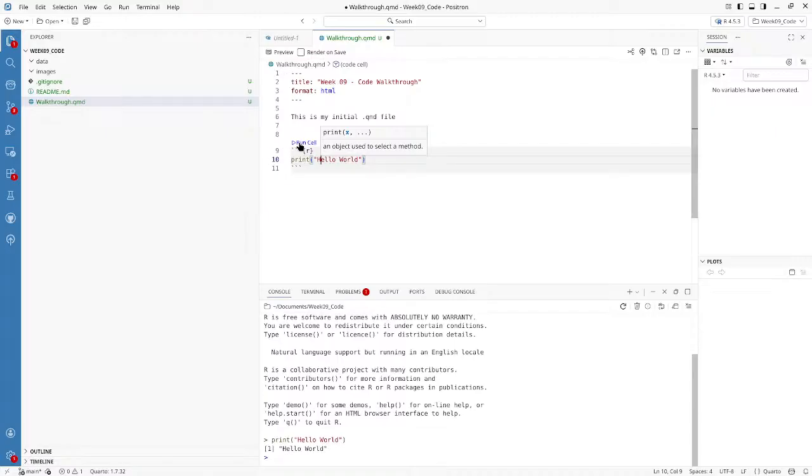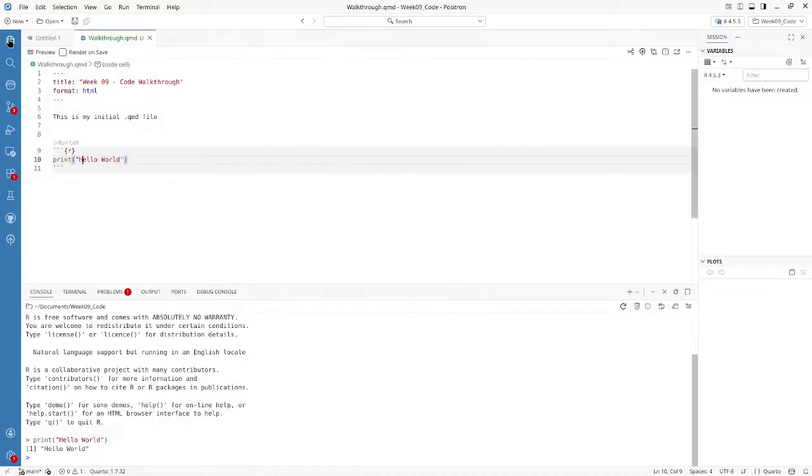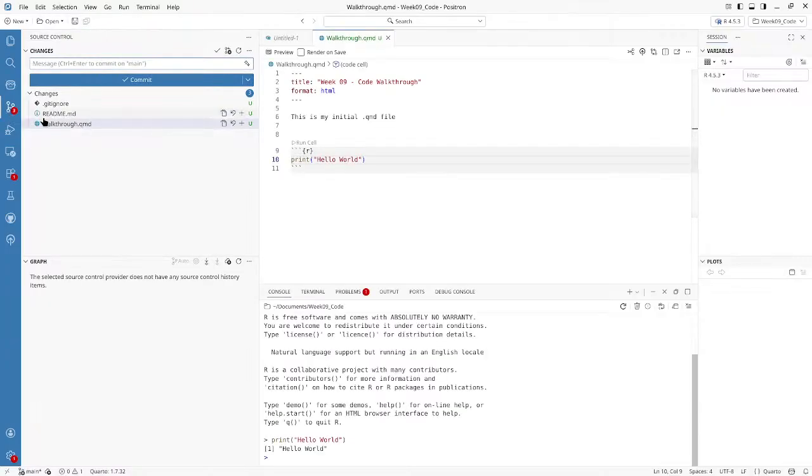Alright, so now that we're coded, this is working properly. Let's just go ahead and hit save. So as we saw a little bit back in the pre-course walkthrough, all this is happening individually in this new repository. We haven't actually staged it. So all these are just locally here. They're not actually going to be tracked by version control. One thing we always want to be able to do is track and revert back if need be. So let's just go ahead and take all these files that have changed and stage them.